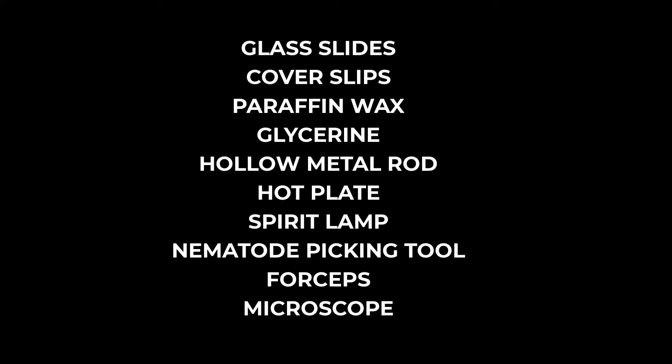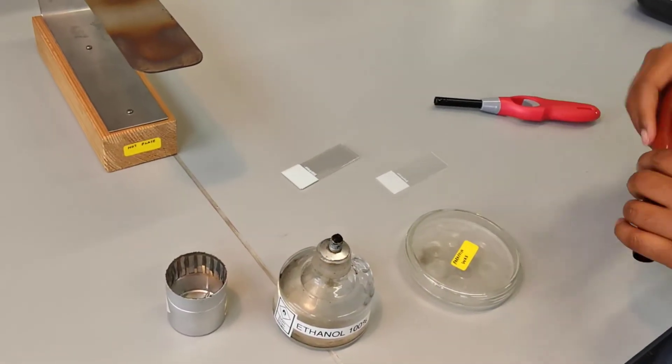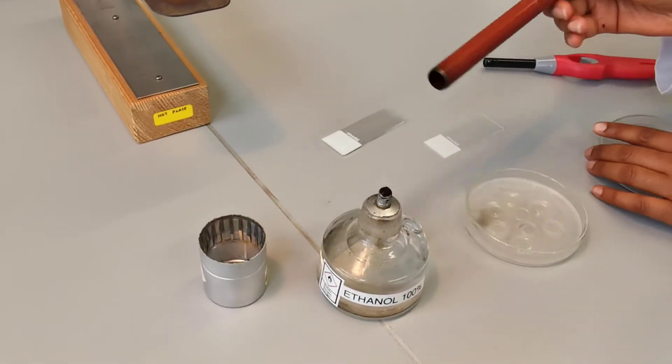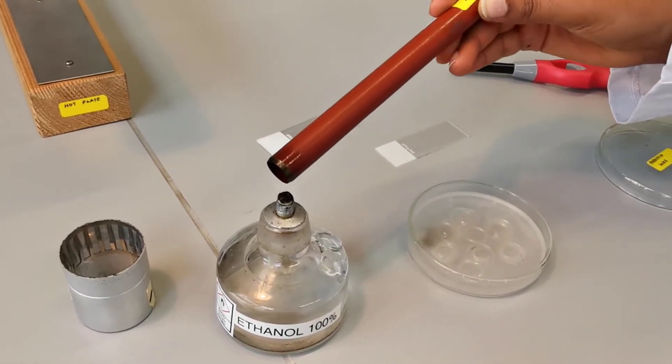These are some of the main requirements for this process. To start with the mounting process, we will first create a ring of paraffin wax on a glass slide using a hollow metal rod as shown here.